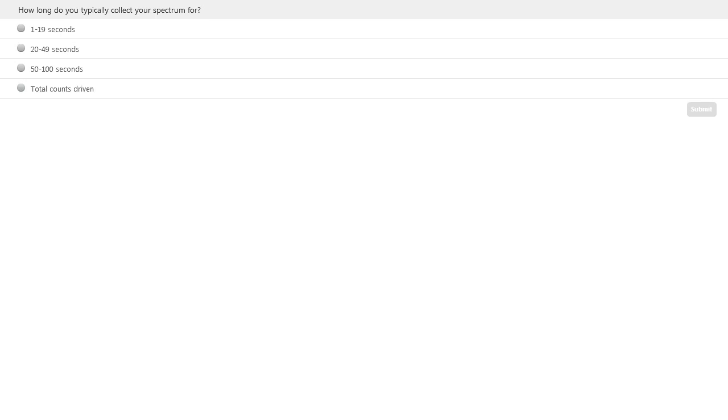This kind of information is, of course, always used by us as we go into our approach as well. We try to do our analyses as similar and as representative to the real-world microscopist user needs as we can. So I appreciate your input. Of course, click on the Submit button on the lower right-hand side when you're done.